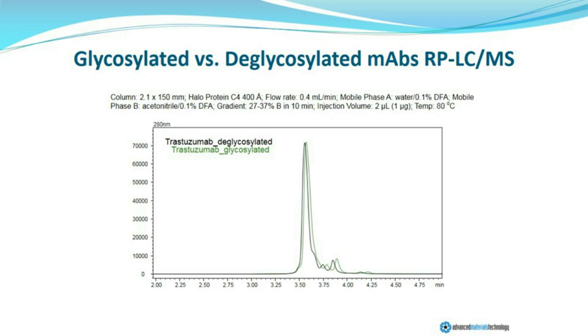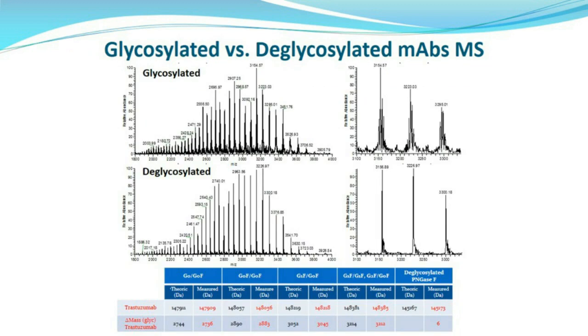protein. Because we've done this experiment with high resolution, in this case with a superficially porous chromatographic material, we're able to resolve these and look at the high-resolution mass spectral data, in this case online, with an Orbitrap mass spectrometer, in order to deconvolute the data and measure the exact masses associated with those variants, as well as with the intact and variably glycosylated therapeutic molecule.